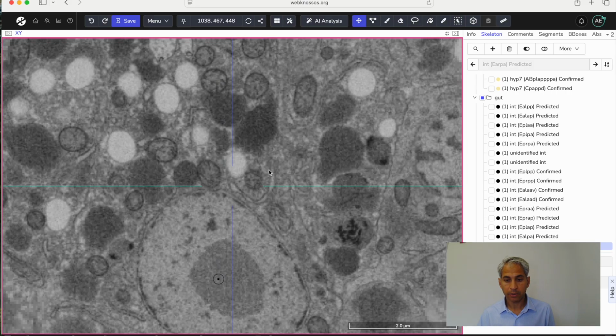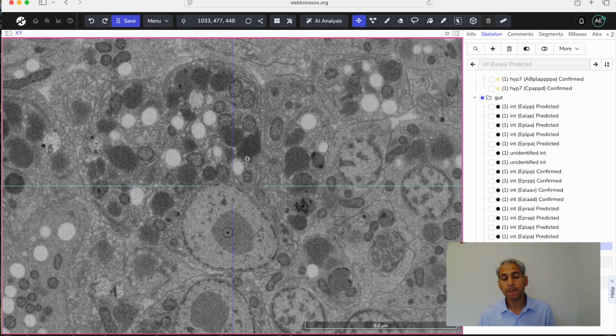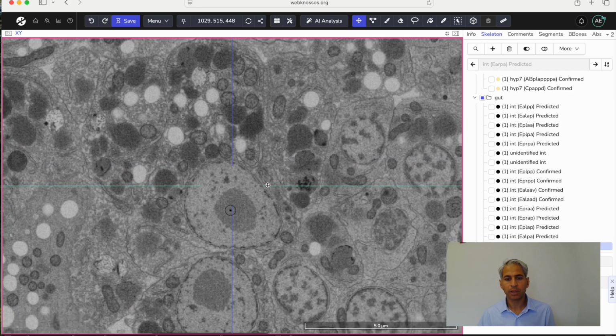And by now, after you've played around with looking at cells, you should know how to zoom in and out and move things around. We can see the dot or the point in the center of the nucleus of this cell. So here's the nucleus, first thing that stands out. And then you can sort of see the perimeter of the cell around here, more or less.